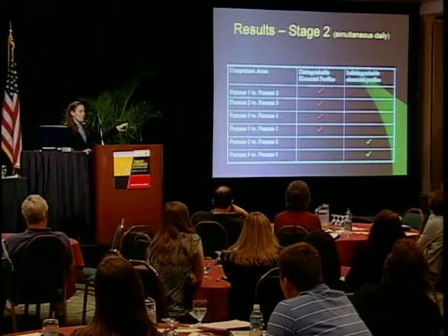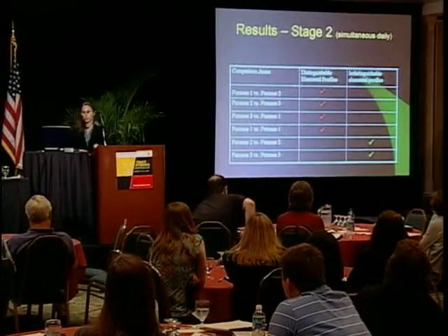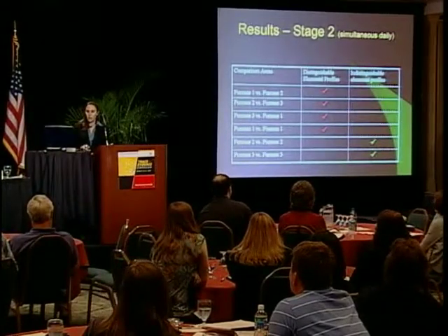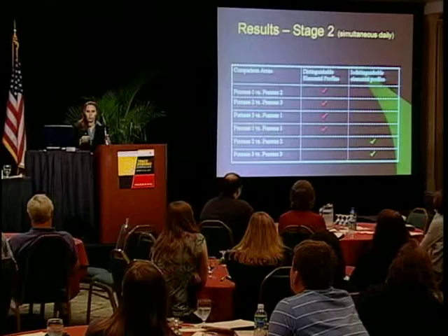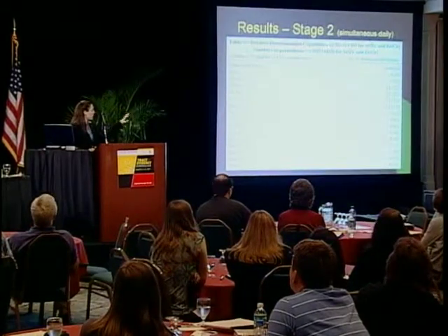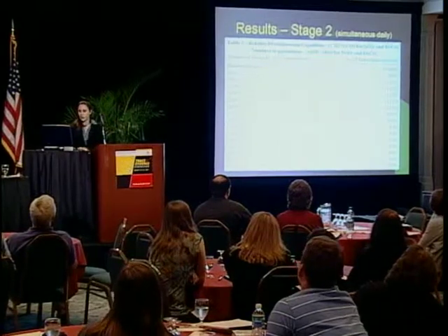But the furnace 2 to furnace 2 was indistinguishable, and the furnace 3 to furnace 3 was indistinguishable, which based on our hourly data we would expect, because these bottles were taken within 24 hours, they were exactly 24 hours apart. So again, graphically, we're just looking at the number of distinguishable pairs.